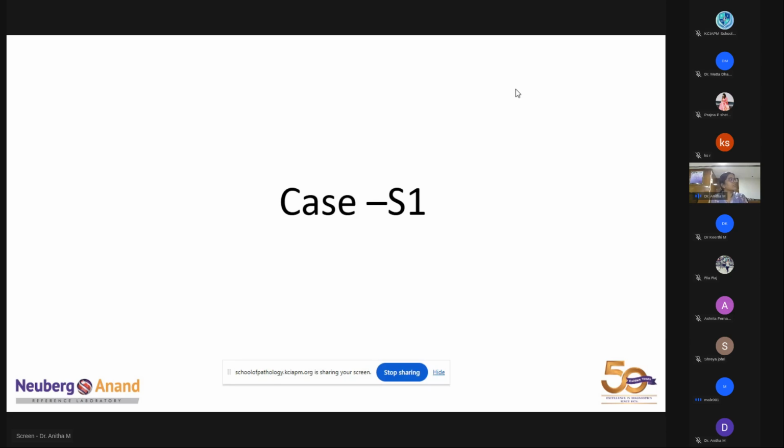Okay. How do you assess cells on the smear? How do you tell it is adequate? How do you count the cells? First of all, we should see that squamous cells are present, ma'am, and we should see if it is obscured by hemorrhage. And 8,000 cells, we should check, ma'am. Yeah, correct.